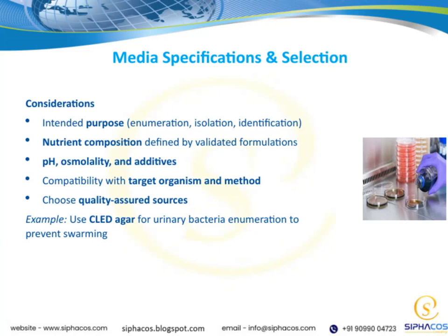Let's talk about media specifications and selection considerations. When choosing a medium, the first thing to think about is its intended purpose. Are you aiming for enumeration, like counting colonies? Or are you isolating and identifying specific microorganisms? Clarifying this helps guide your choices.